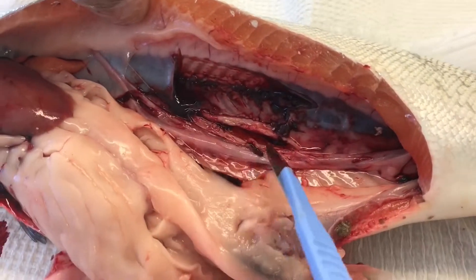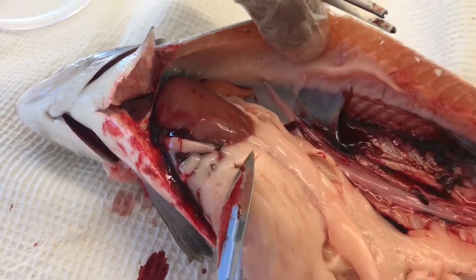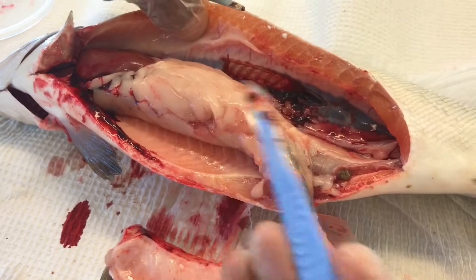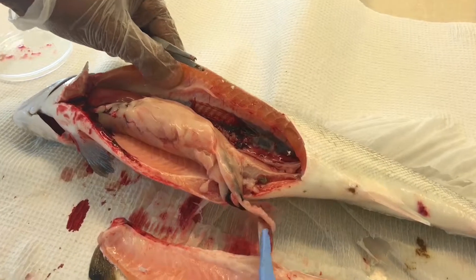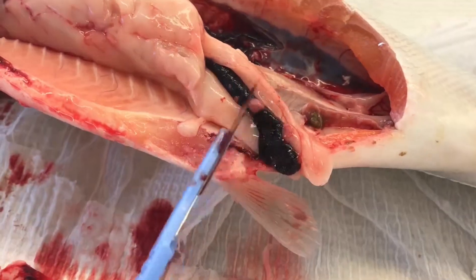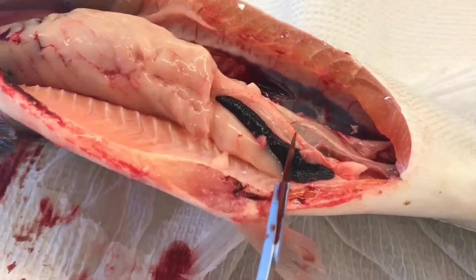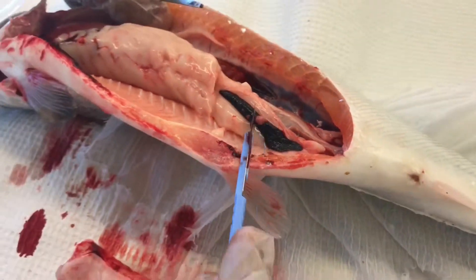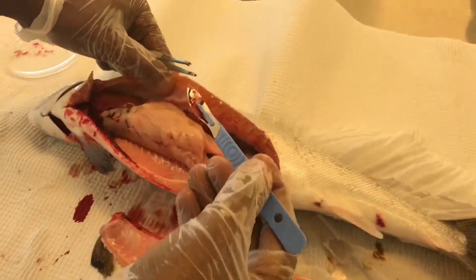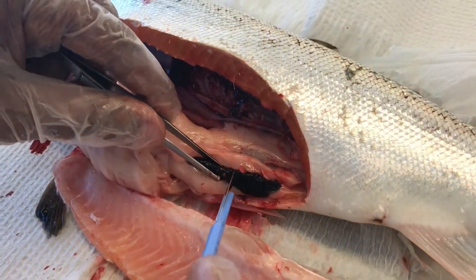Here you have the deflated swimming bladder. Here you see the liver, the peritoneal fat with the intestine, the stomach, and the pyloric cecae. Here we have the spleen — really a big spleen, but it's quite normal. It's not swollen or showing any kind of lesion. Still, we take a portion of the spleen.